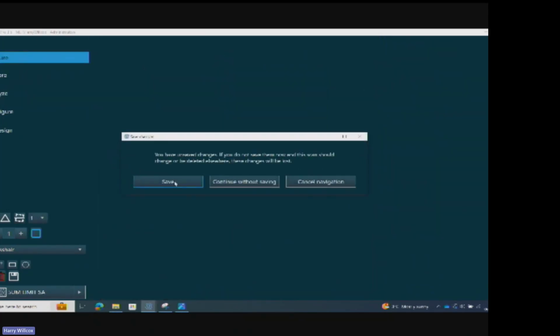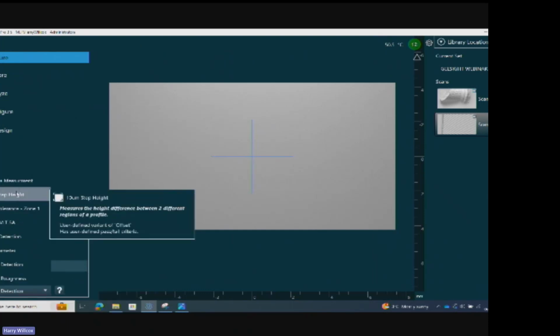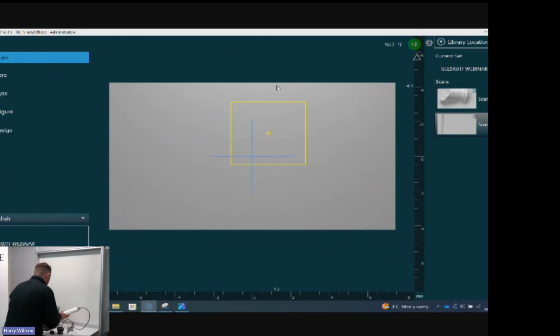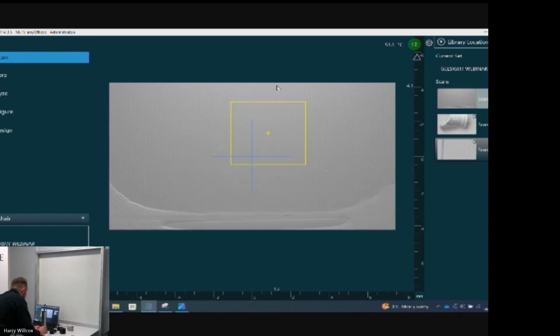So if we go to our capture window now, and I go to scan, run routine, and click my 5 limit SA, you can see we've already had the field populated on the software. If I take my sensor, go to the surface, click acquire, we've effectively, within, I don't know how long that was, maybe 45 seconds to a minute, created a program and measured the sample, and within the next 5-10 seconds, depending on your processing power, I'm going to report the information for that.